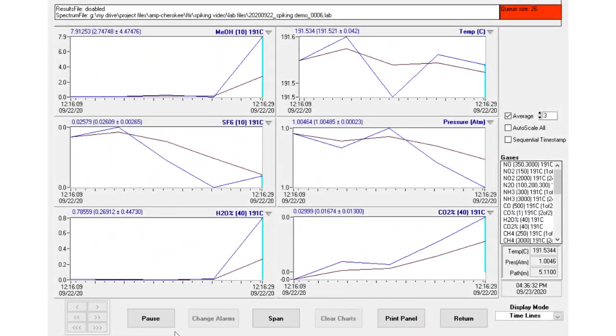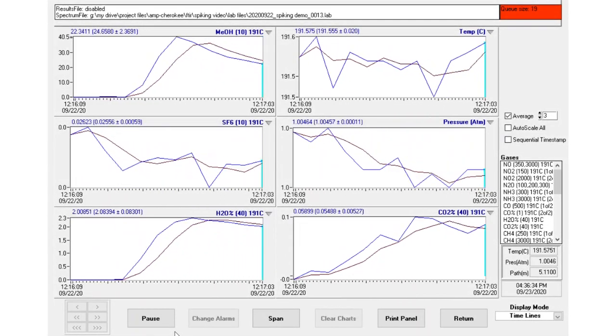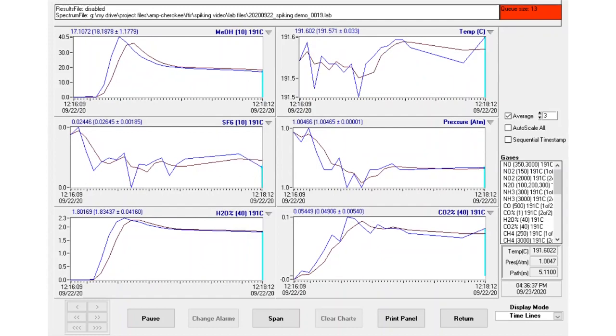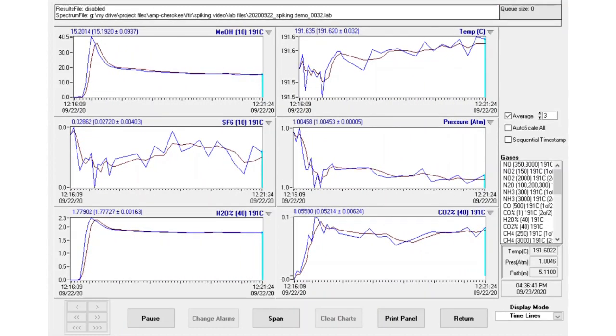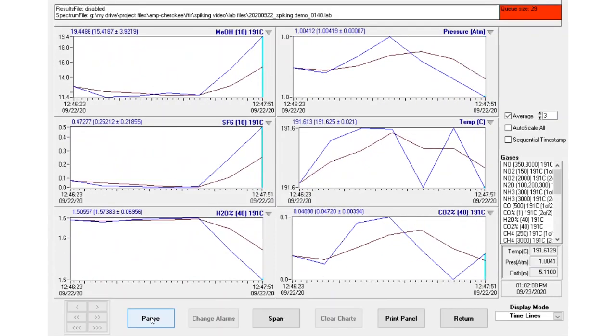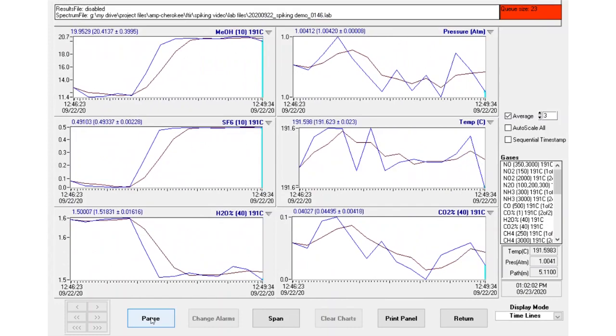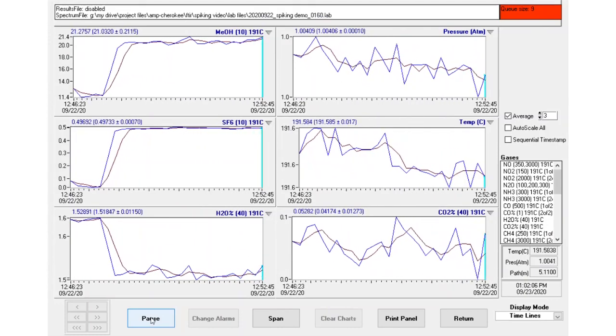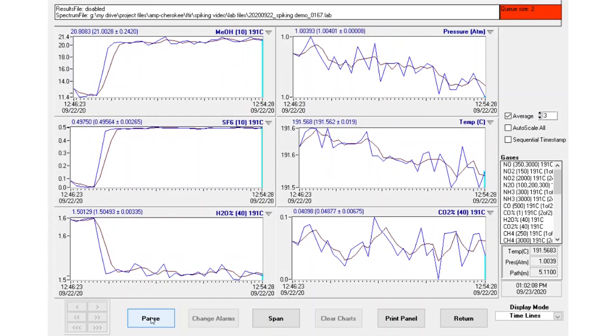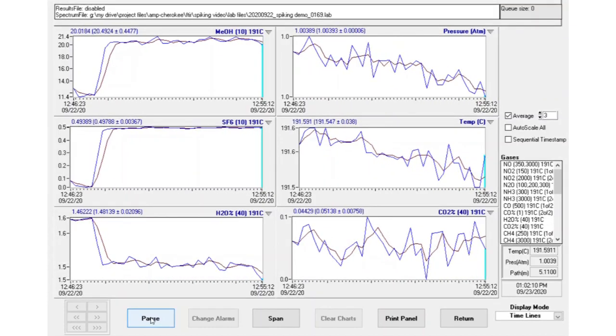We're running scan averages of 15 scans, that's approximately 15 seconds. That's for the sake of time. Normally during stack testing, you're running 64 scan averages, or roughly 1 minute. So we need to determine our spike analyte response time by introducing the spike to the sample. Method 320 has you obtaining stable data for 5 minutes to ensure that you've gotten a correct response time.